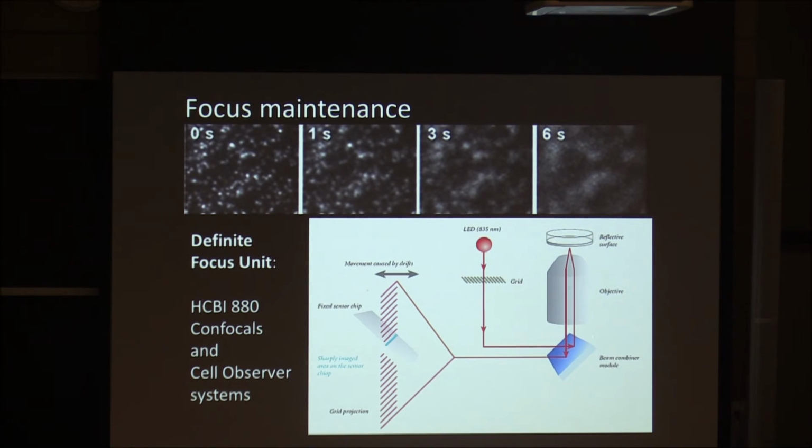So it's a little bit different. It takes an infrared laser beam and just bounces that back off your sample, and it comes back onto a quadrant-based detector. And as soon as that reflected laser bounces off the middle of that quadrant detector, it readjusts for it. So it's definitely the gold standard in the industry right now. And that one's fantastic because it can actually run continually. This one can run continually as well, but you sometimes get, especially if you get into a red far right channel, you'll get some bleed through this LED that you're using.